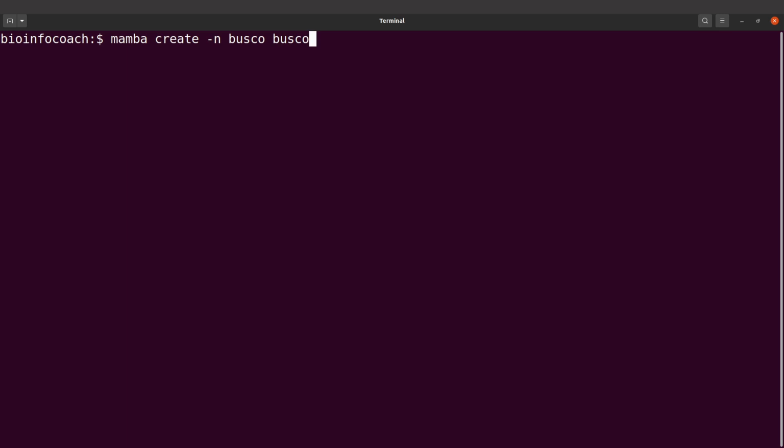And then we are going to add channels. So I'll say -c bioconda, -c conda-forge, and then -c defaults. I'm going to add these 3 channels. Once we do this, we can execute. So let's execute this command to install BUSCO.